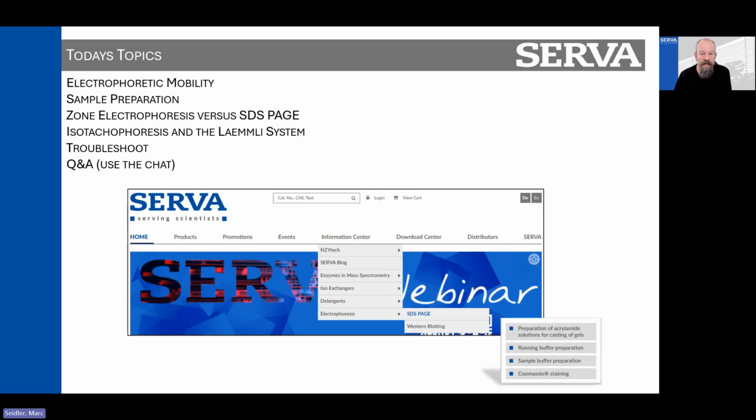Again, everything that I explain, all the recipes and so on, are found on our information center, electrophoresis SDS-PAGE, and then you find the recipes there. So no need to note stuff down. Simply listen and watch the webinar. You can watch it again on YouTube then.